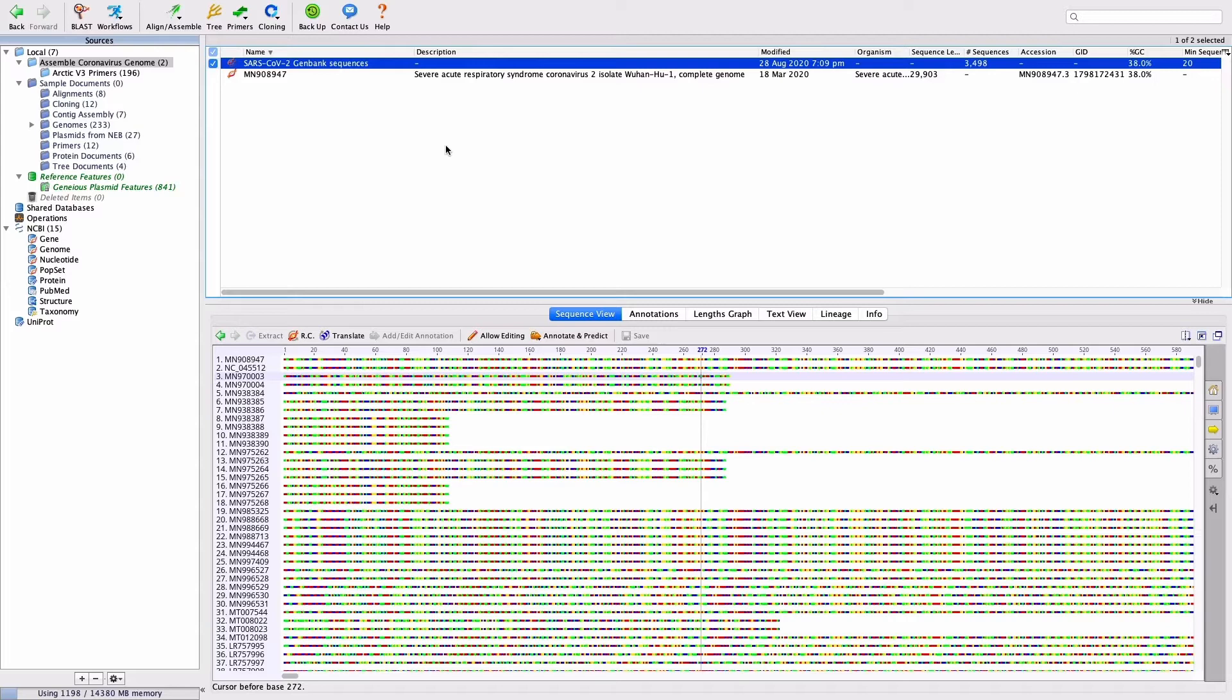For paired end sequences, which have not been merged, the amplicon primer is located at the 5' end of each read.